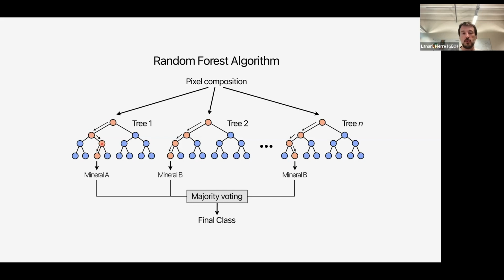And then if aluminum is lower than 2,000 counts, you go there, and this would be a mineral, for example, quartz. So the tree is automatically optimized by the algorithm, and basically it gives you a path, and you can give all the pixels, and it will give you minerals at the end of the branch.